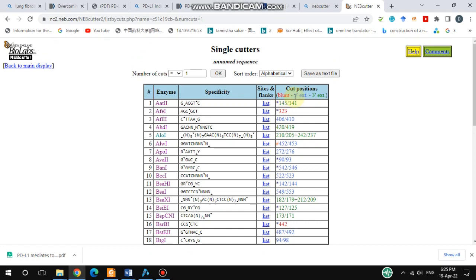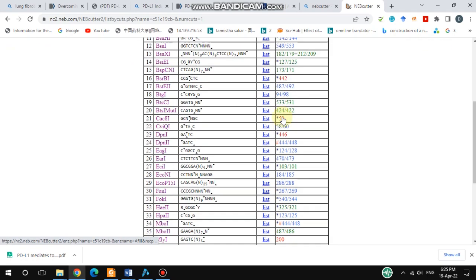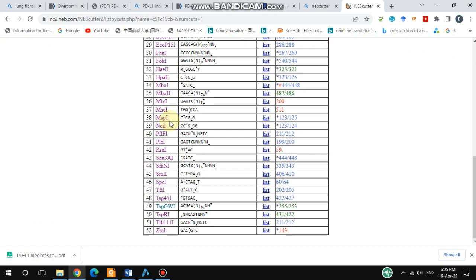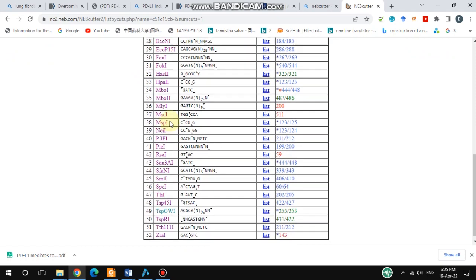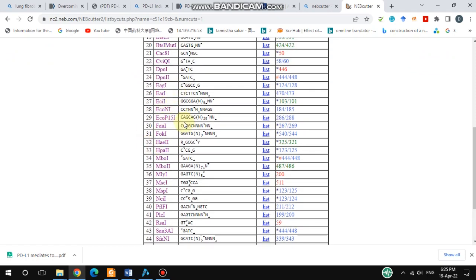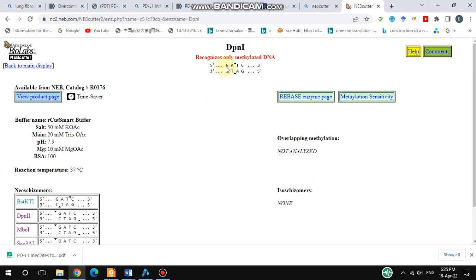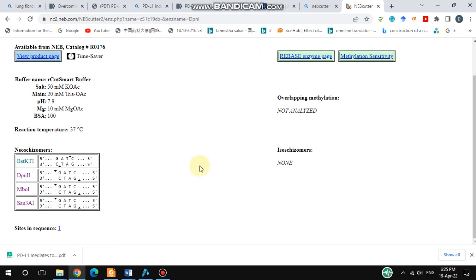The cut position is mentioned here — it tells you which part the enzyme cuts. For example, if you look for DPN1, you can find it here. DPN1 cuts at the GATC sequence. This is the kind of detailed information you will get.